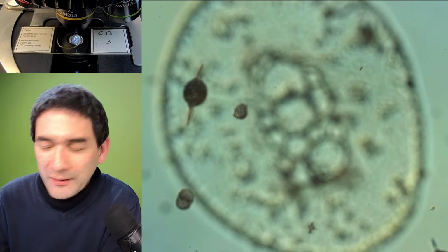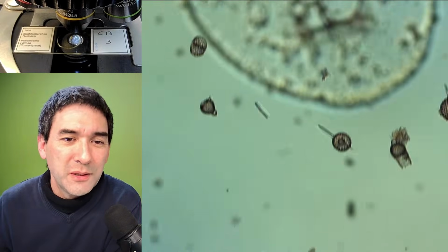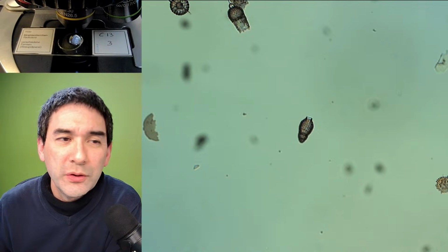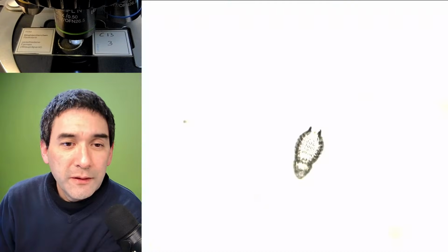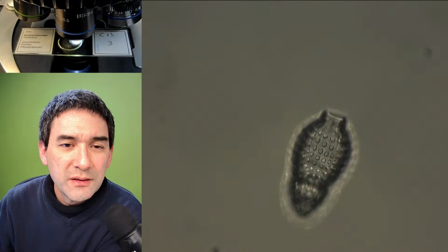No, that's not the one. Yeah, here we go. That's some kind of dirt or whatever. Here, this is how they look. And I'm going to go up now. And here we go, in bright field first. Okay, let's go up again. So these are the so-called Radiolarians.